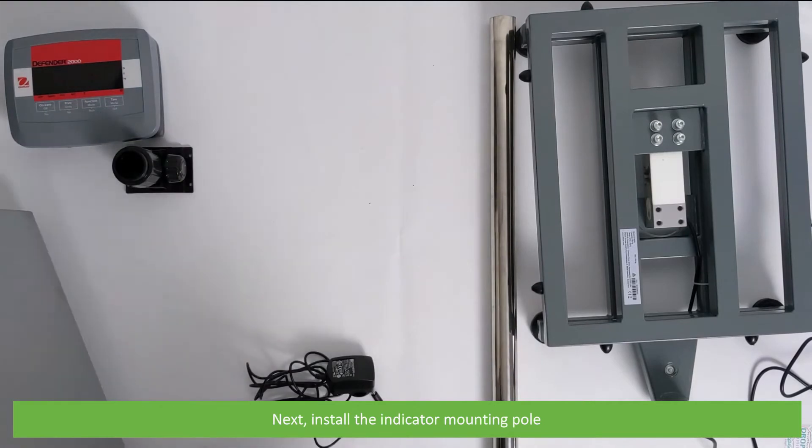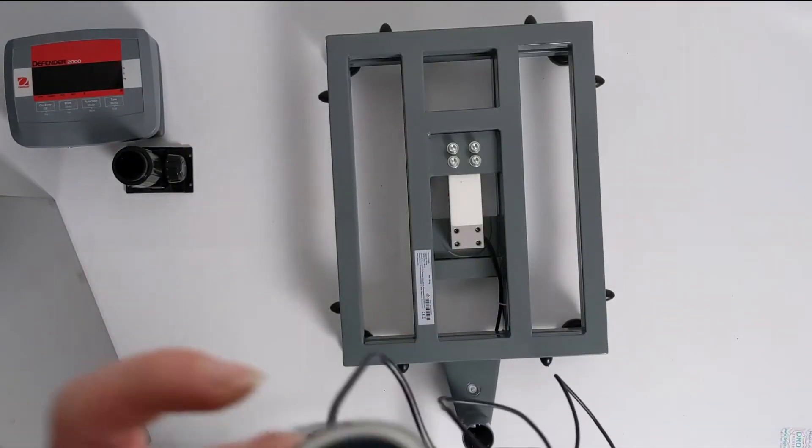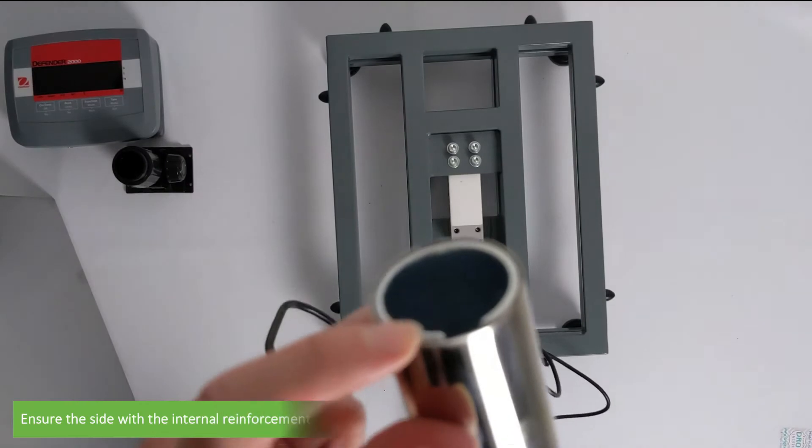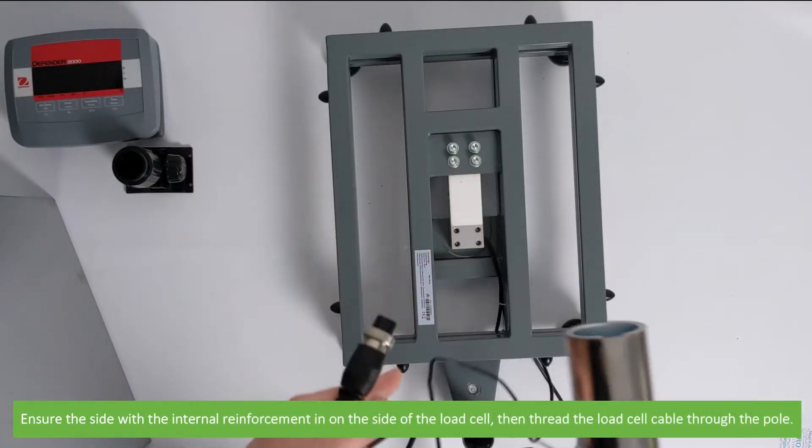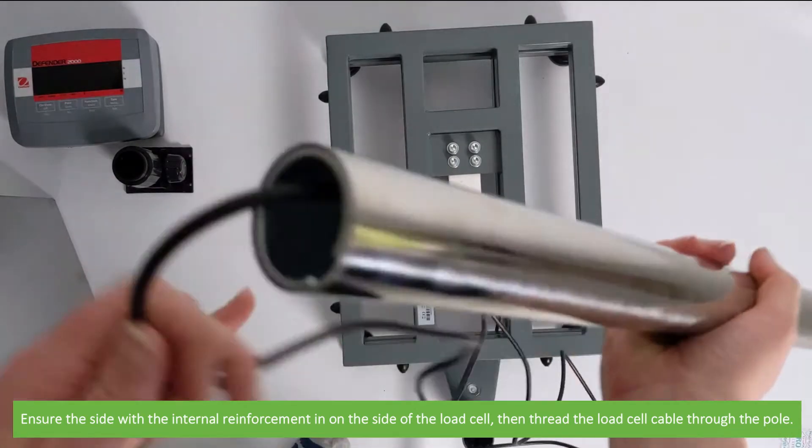Next, install the indicator mounting pole. Ensure the side with internal reinforcement is on the side of the load cell. Then, thread the load cell cable through the pole.